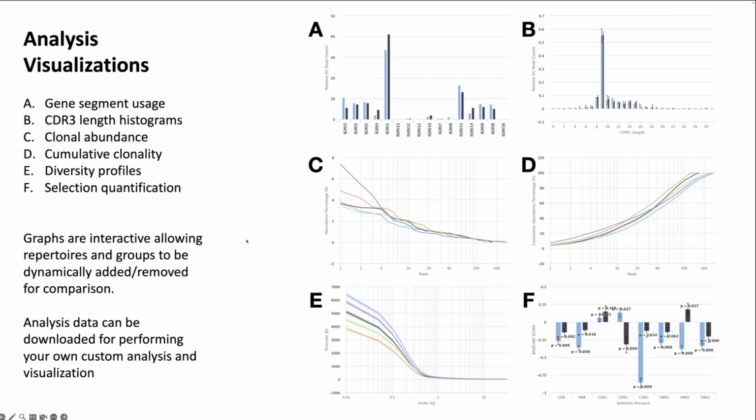These are all interactive. So I'm just showing you a static snapshot here, but all of these have drop down buttons where you can pick what samples you want to display. If you've defined groups, you can then show multiple groups on there. B here is an example. This is group, and I can tell that because it's showing you averages with error bars for two group comparisons here.